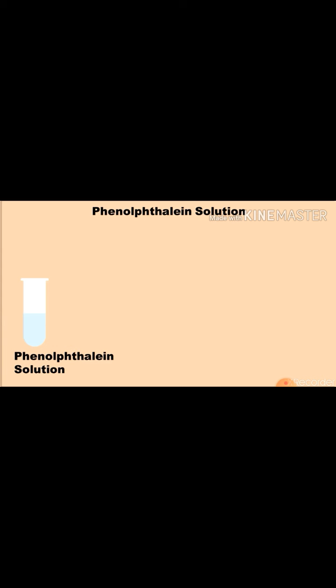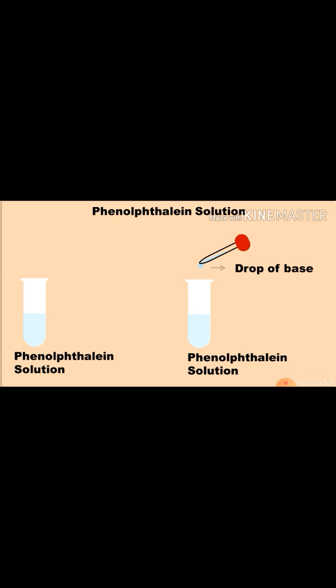Take another test tube half-filled with phenolphthalein solution. Pour few drops of base into the phenolphthalein solution. Pink color appears. It means phenolphthalein solution changes into pink color in the presence of base.